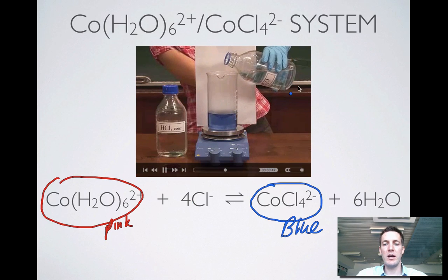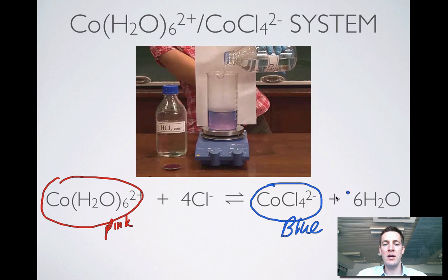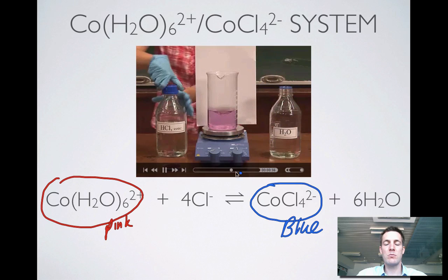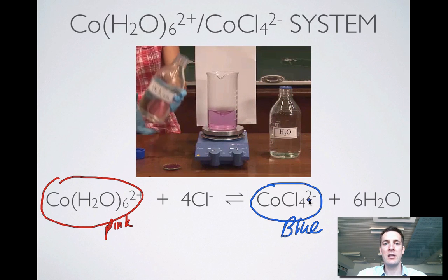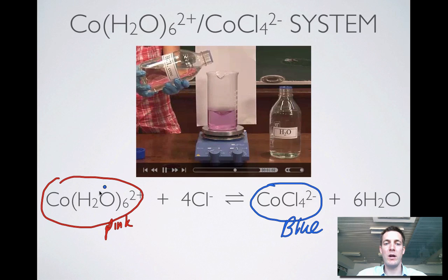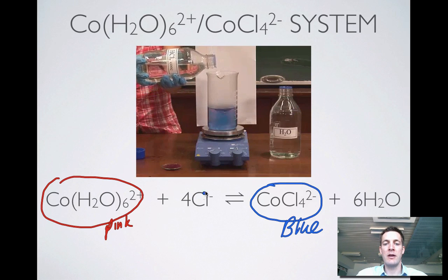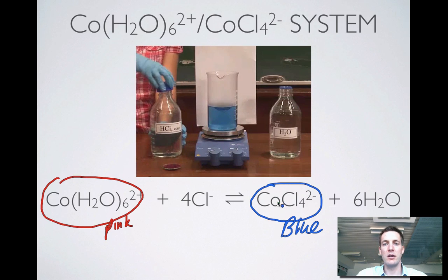Now what are we adding? We're adding water from this big bottle here. So I'm adding a product. So instead of adding a reactant, I'm adding a product. What happens? The system goes back to the pink side. So if I add a product, the equilibrium seems to be shifting away from the products to the left. Here again, we're adding the reactant, chloride ions. If you add enough of them, the system shifts right over to the right to the blue ion again.